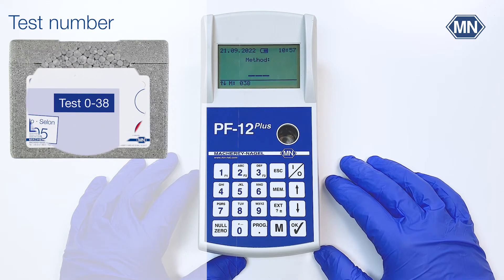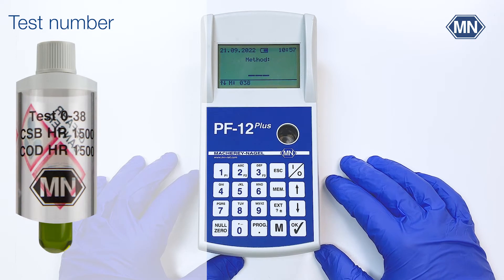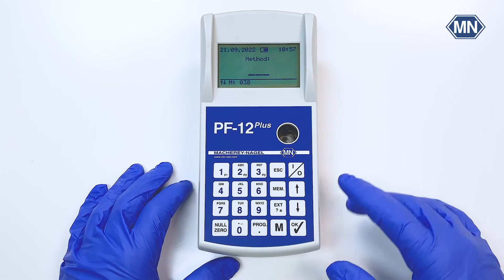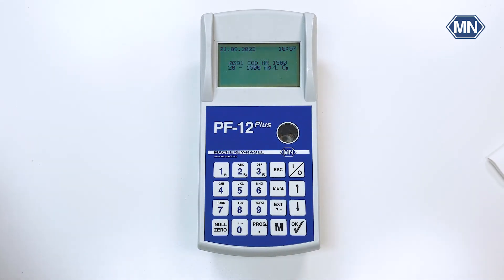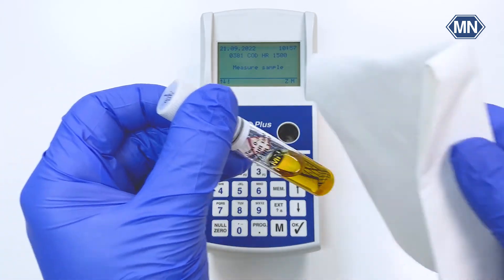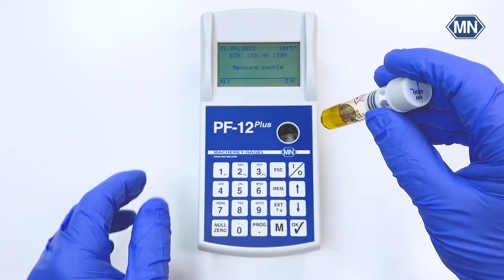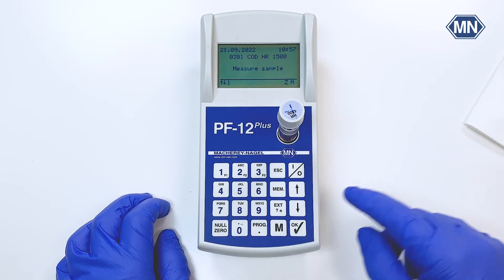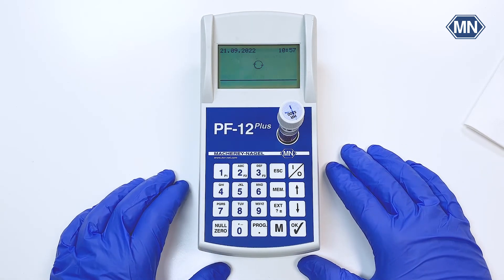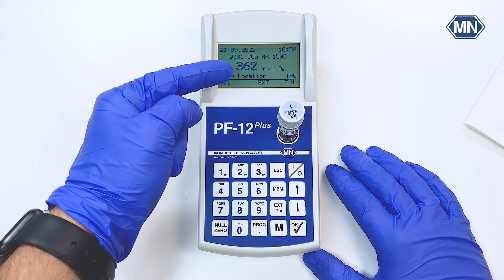I already prepared and digested a sample of the COD1500 test which is now ready to measure. For this we enter the test number and give the cuvette a good clean from the outside. Then insert the sample into the cuvette slot and press M for the measurement. After a few seconds the photometer will display all important information and also the concentration of the sample.